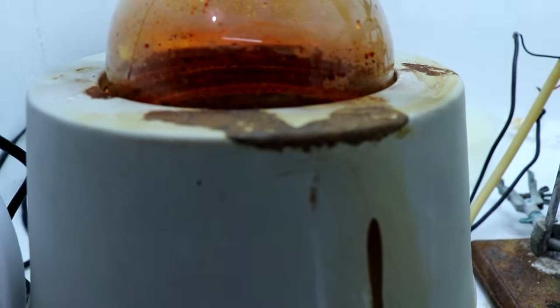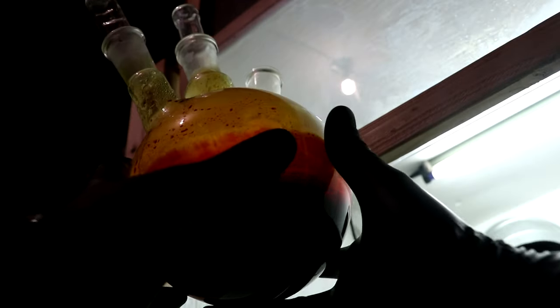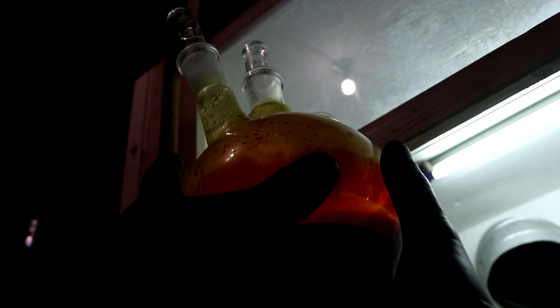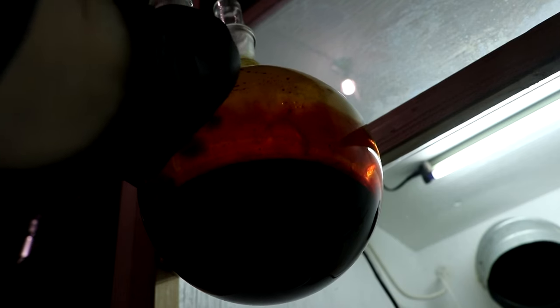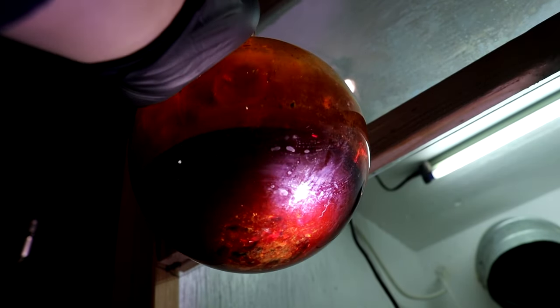Here, I want to actually look at and see what that gold looks like right now. Okay, so I've taken the flask out so we can look at it, and the first thing I notice is that it's rather warm. It's not quite hot enough to boil the bromine, but it's heated up a little bit. And I don't have the heating mantle on, so that's all heat just from the dissolving gold. So I guess dissolving a larger quantity might be a problem. So it's good that I started with a small batch.